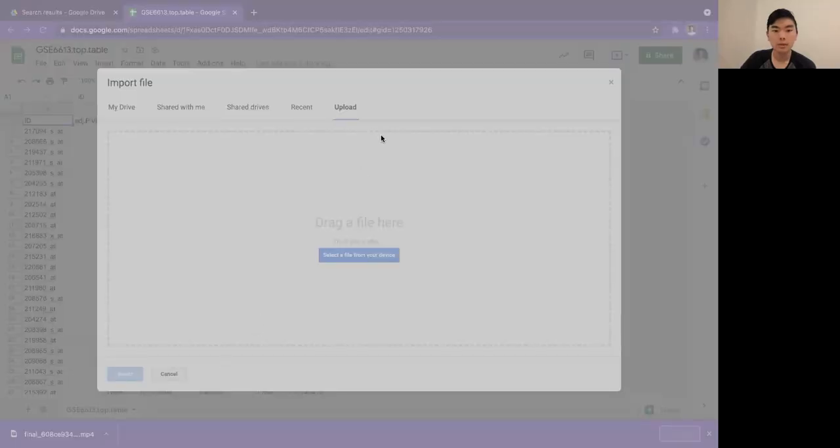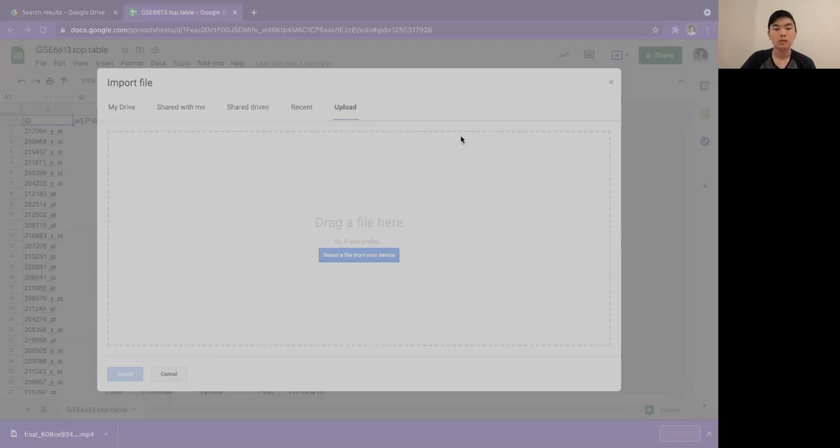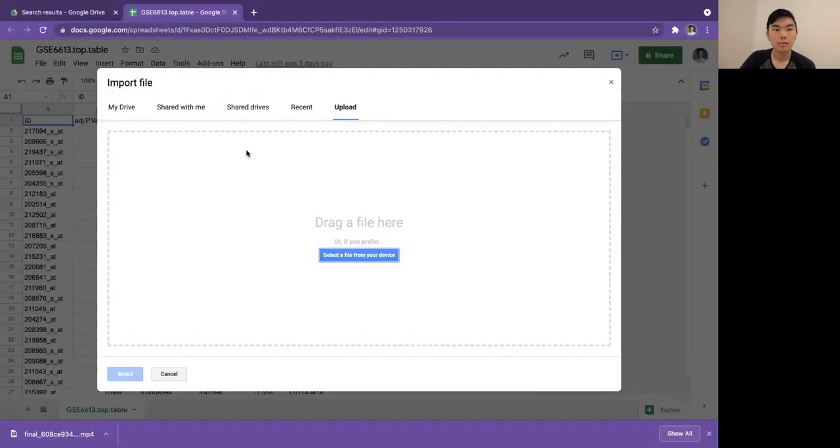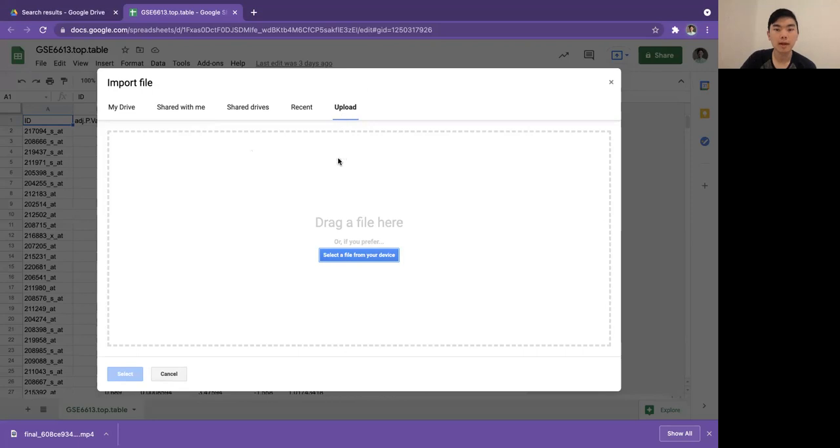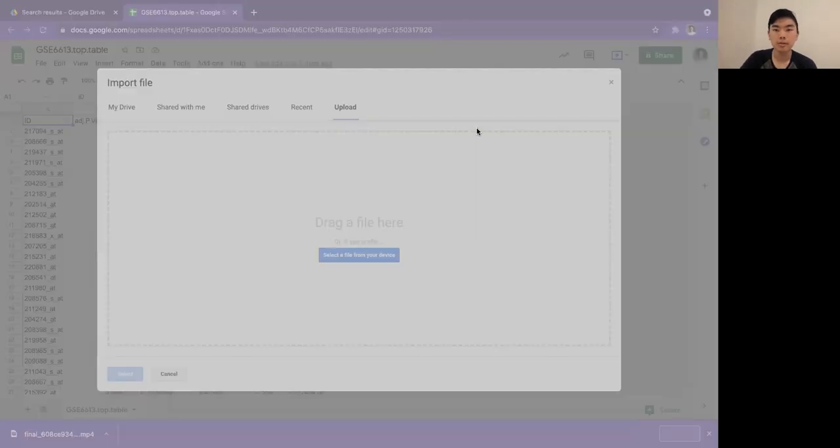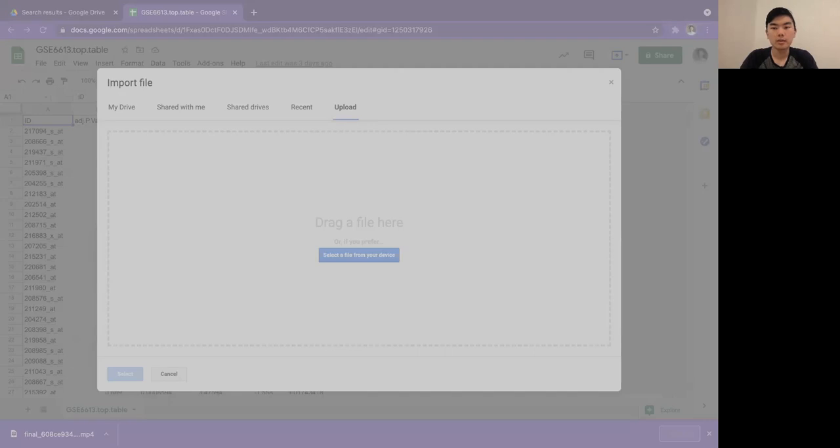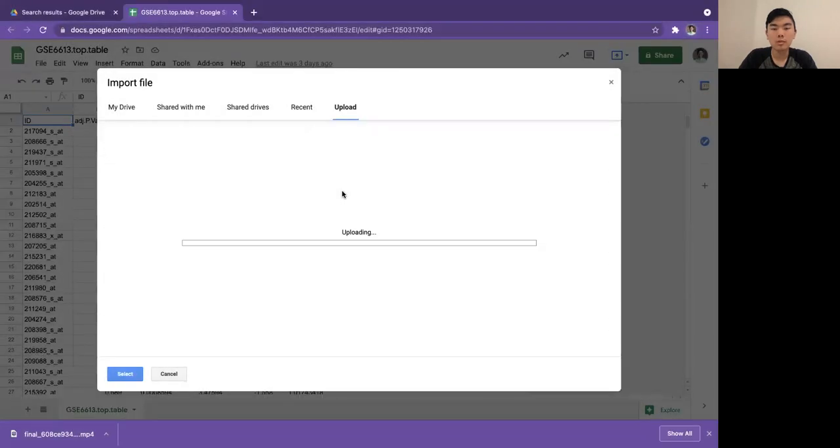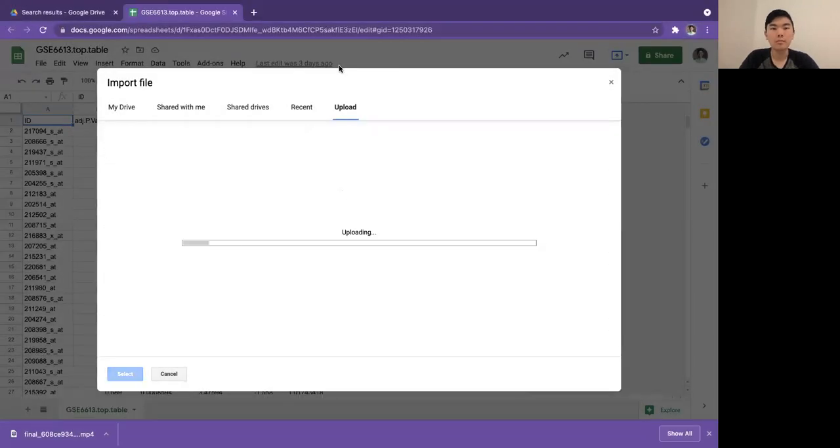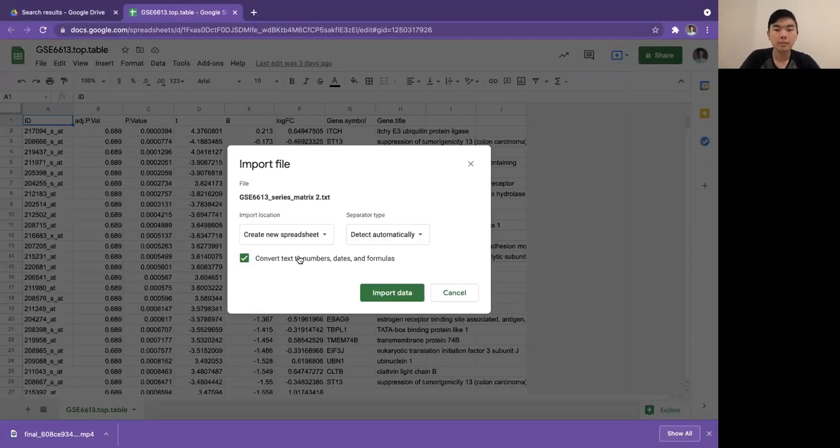So where we left off, we were just about to import our data into Google Sheets. I'll show how to do it. We went to file, import, and import data, and now we're going to the upload tab and selecting a file from our device. I'm just going to double click on the file we made in the previous video.